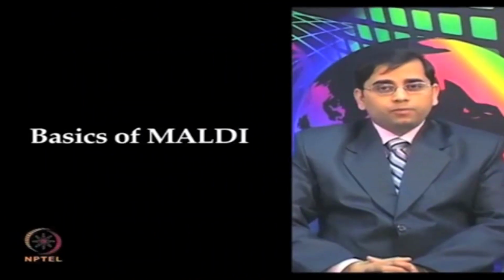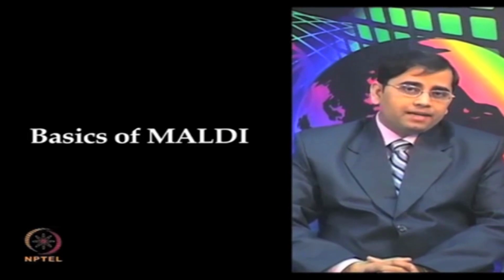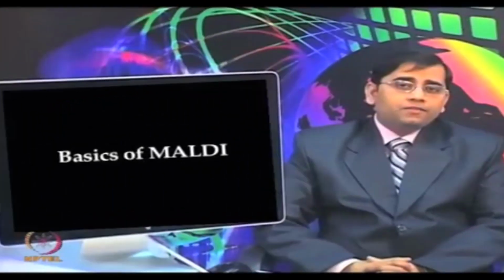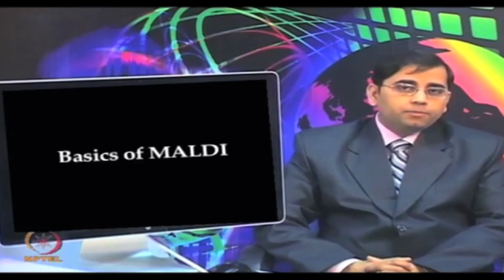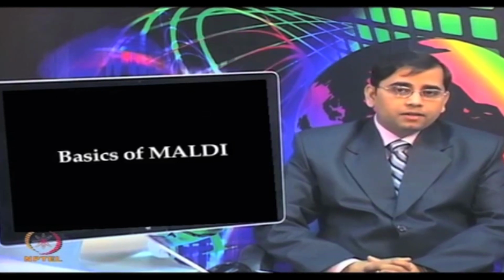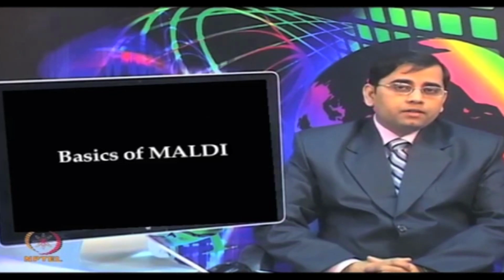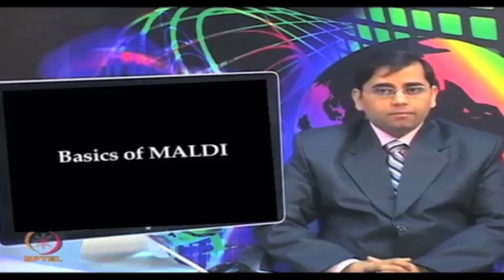So, MALDI is an efficient process for generating gas phase ions of peptides and proteins for mass spectrometric detection. MALDI is one of the most widely used ionization techniques currently applicable in the proteomics area. This ionization method was independently developed by two scientists, Koichi Tanaka and Hillenkamp. Tanaka also received the Nobel Prize for his novel contribution to soft ionization techniques such as MALDI.